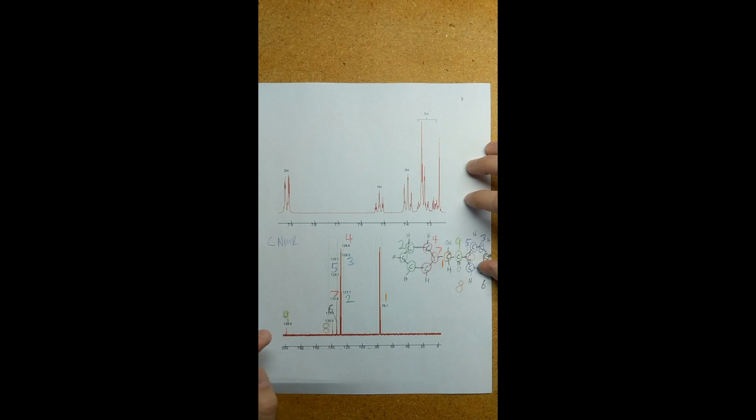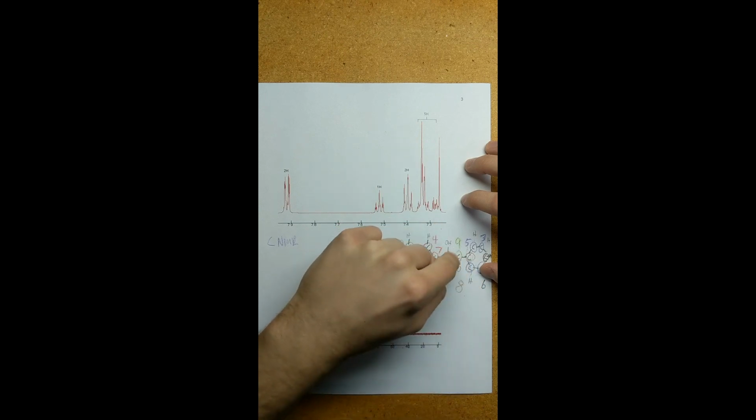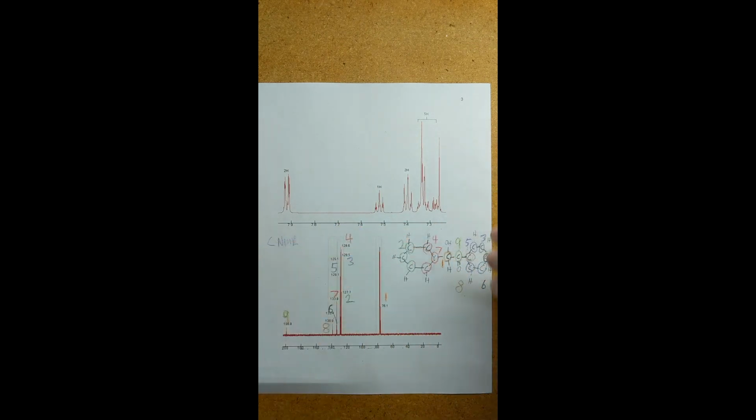Now that we've looked at 8, we're on our last group here, number 9. At 198.8, that is a much higher group, and it does line up with what we would see as a C double bonded O, and we do have that exactly right here. This carbon being directly double bonded to an oxygen would be, of course, pushed the most downfield, and be the most deshielded. That concludes our carbon NMR as well as other processes.